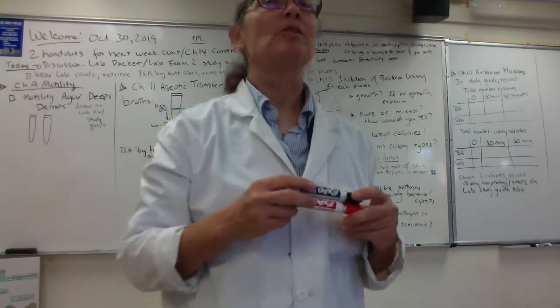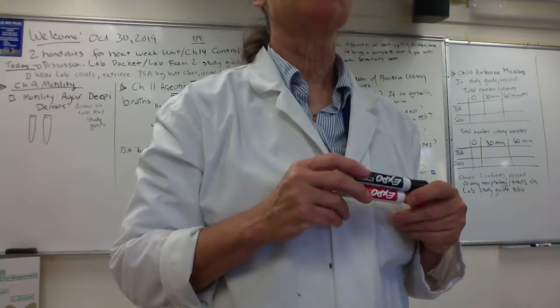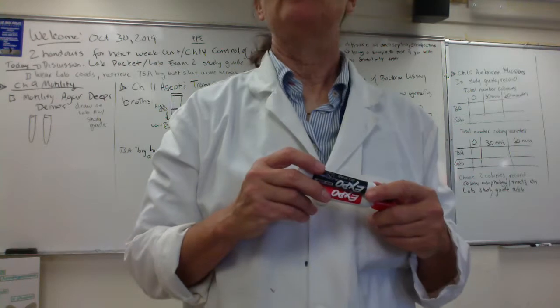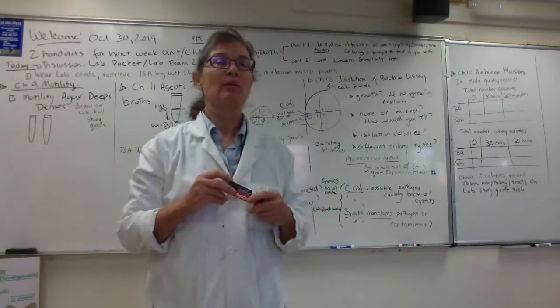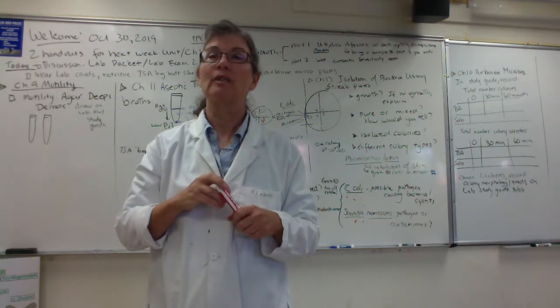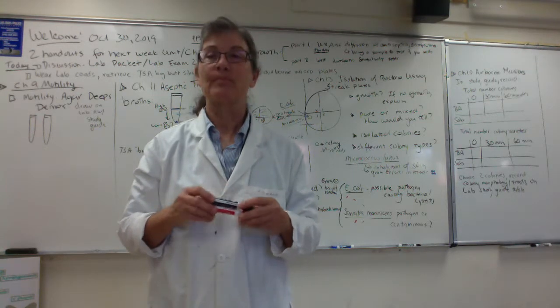Do you think we could do that on the lab exam, folks? Do you think we could give you some streak plates? Say 3 different streak plates, and say which ones, if any, are contaminated. And do you think we try to be sneaky and have one of the plates where the contaminants are only in quadrant 1, so you'd have to carefully inspect them? Yeah. Does that make sense, folks? Okay. All righty then.